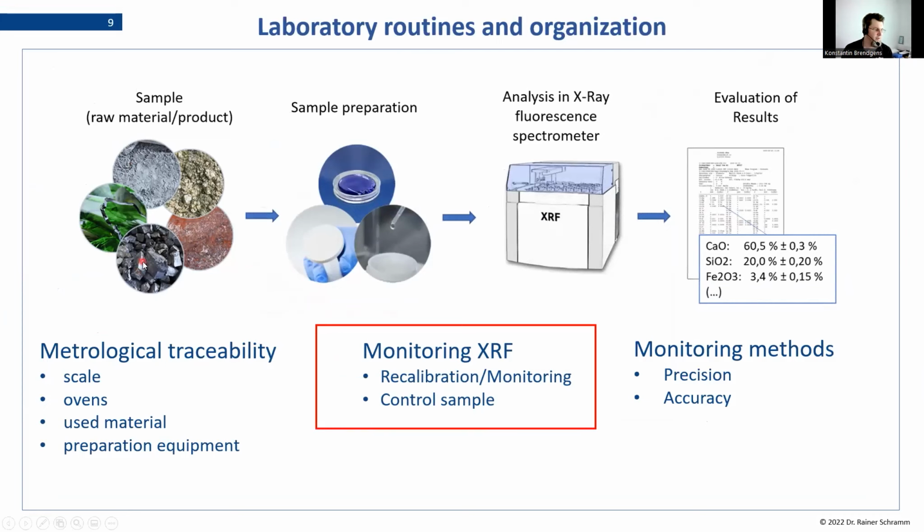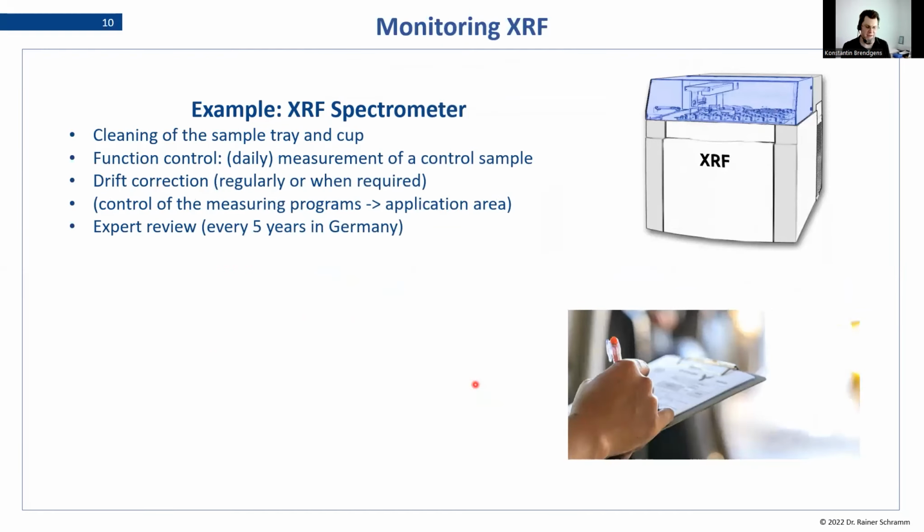So we've got both those covered. And how does this now translate to the actual measurement and the monitoring? I think this is where it gets a bit more interesting. First of all, coming to the spectrometer with the prepared samples, what are the points to check here is, first of all, make sure that the equipment itself, again, is clear and in a good shape.